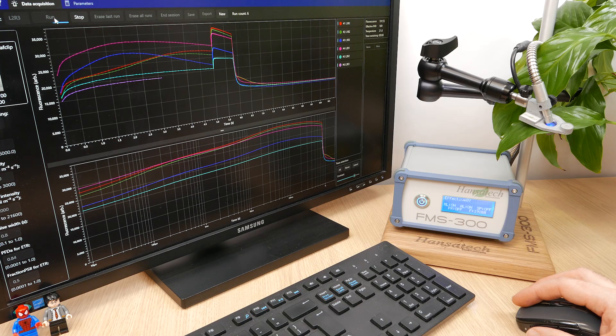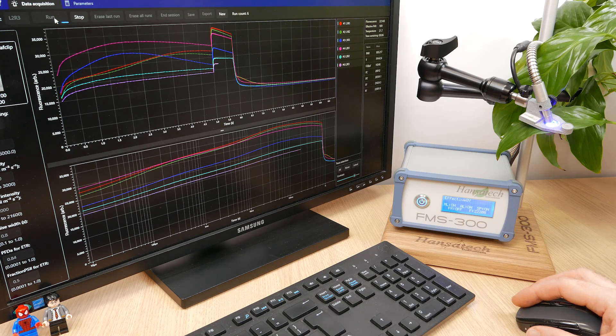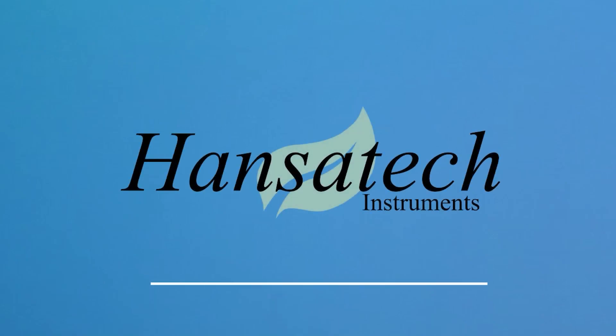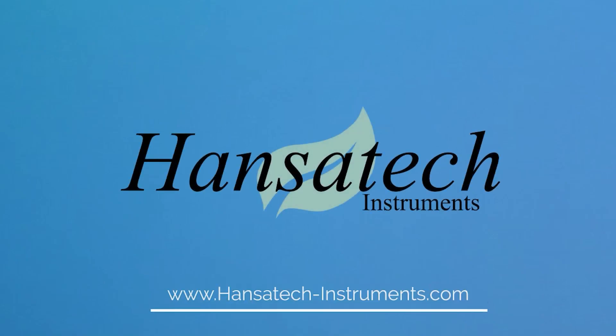Please see the FMS 300 manual for more details.